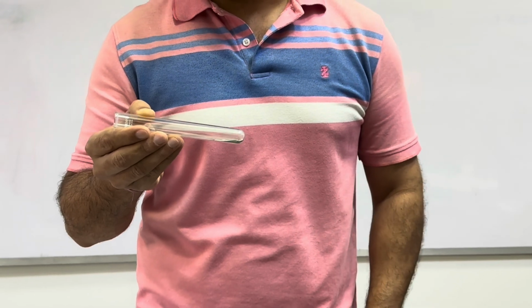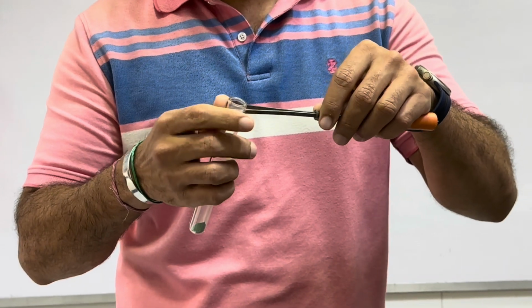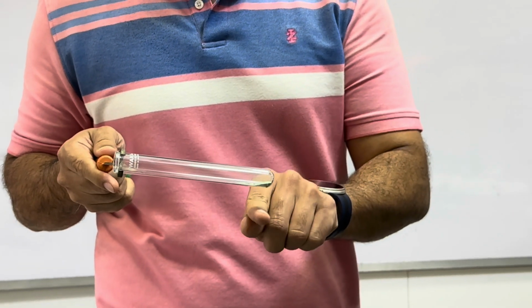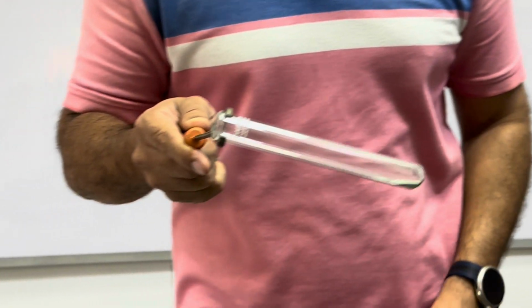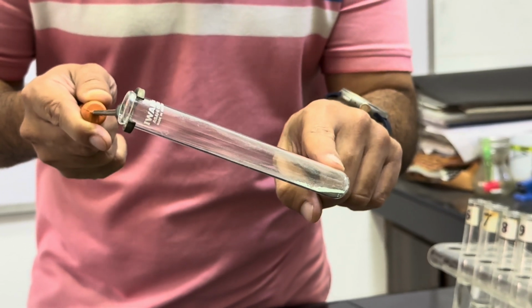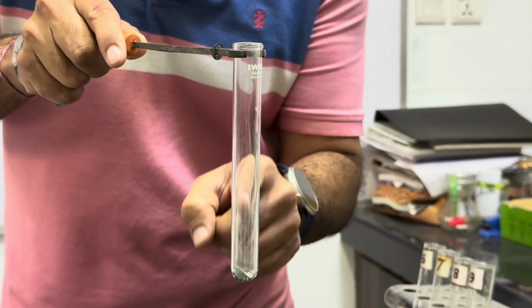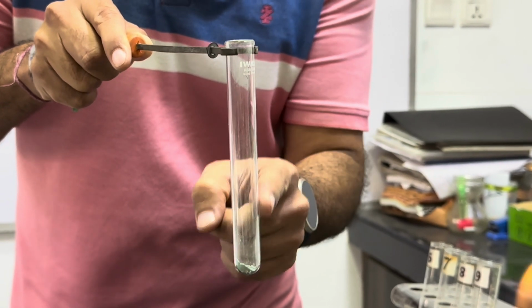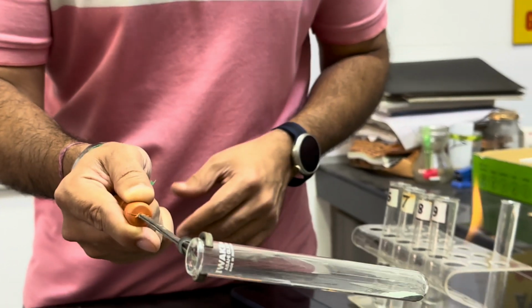So we have taken here our Fa6, which is a green solid, and we will heat this strongly by putting it in this test tube holder. Spread this a bit so that heating will be done for all the solid equally. Now we will heat this test tube in a way that it will be tilted a bit. We must not heat it this way because if there is any gas or vapors liberating, they must be condensed on the neck, so we can see if there are any vapors liberating. Therefore we will be using this way. So now let's heat this tube.